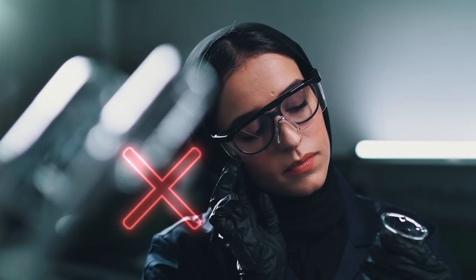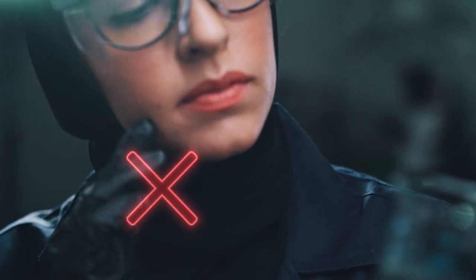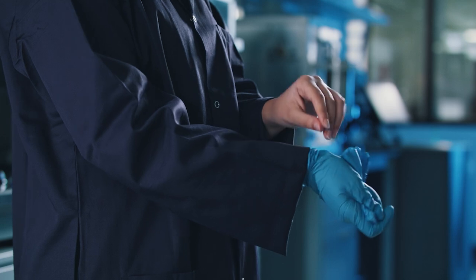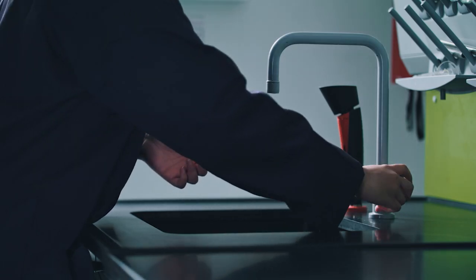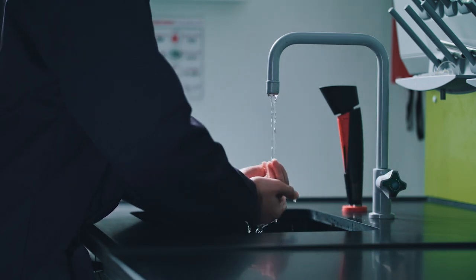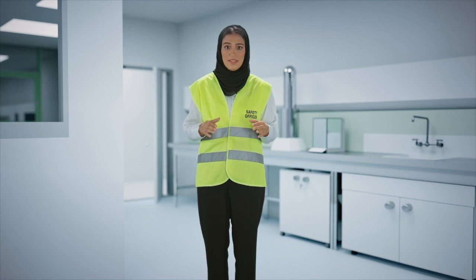Keep your hands away from your face, eyes, and mouth while handling chemicals. To avoid an unintentional spread of chemicals, remove your gloves before leaving the work area and handling any doorknobs, keyboards, cell phones, or elevator buttons. After removing your gloves, wash your hands with soap before exiting the laboratory. Please inform your instructor if you have any chronic diseases such as epilepsy.